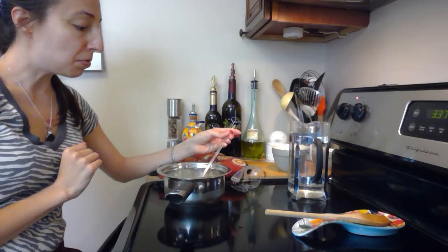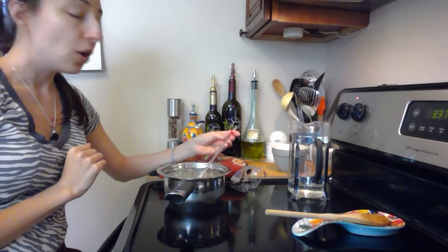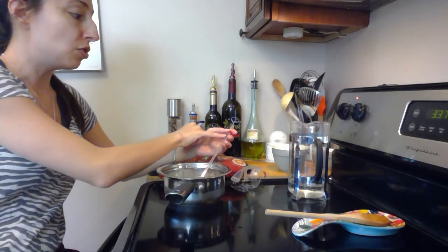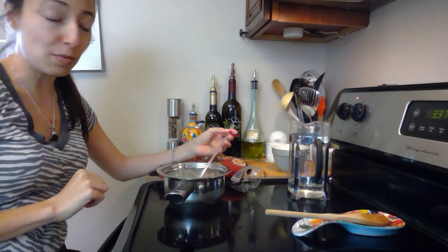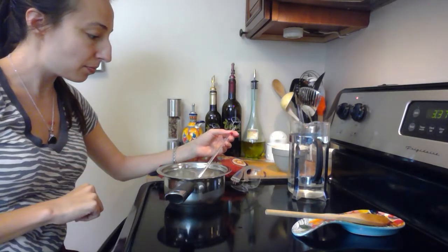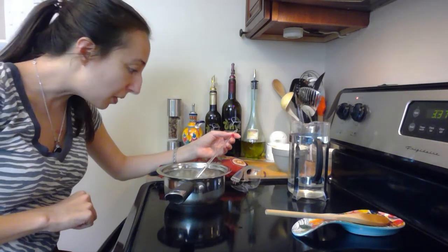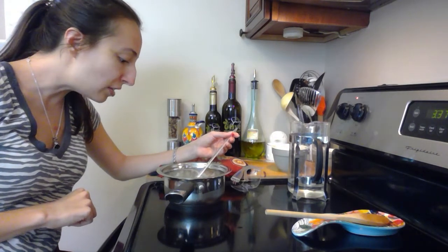Now your reading should be right around 0. We do want to record this in Celsius or centigrade, so make sure you're using the correct side of your thermometer for the entire experiment. And it looks like my line has stopped moving, and I am actually right around 1 degree.